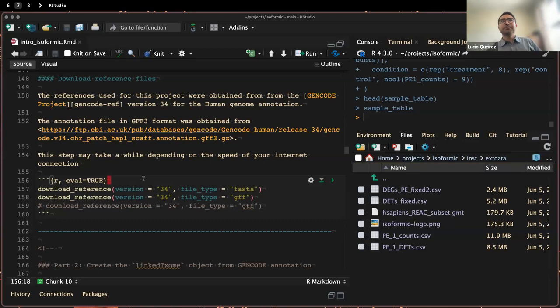Like Isabella was saying, we tried to compare with other annotations, but what we see is that definitely the annotation you use changes everything. When you summarize the expression at the gene level, if your annotation contains just one or two transcripts per gene, then your transcript-level expression is going to be almost the same as the gene level, so you can't really distinguish the contribution of individual transcripts. Here we are showing GenCode, but I also did it with the FANTOM annotation, which has a lot more transcripts because they incorporated CAGE-seq data. CAGE-seq is a methodology that identifies the transcript start site, and they call different transcript start sites different transcripts.